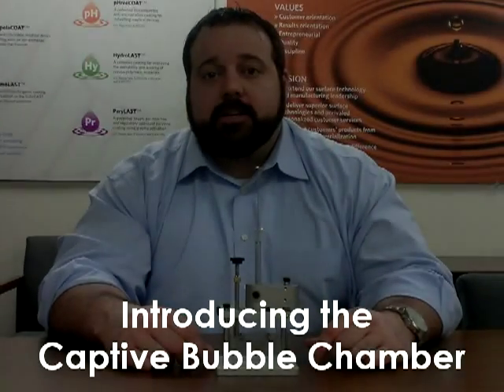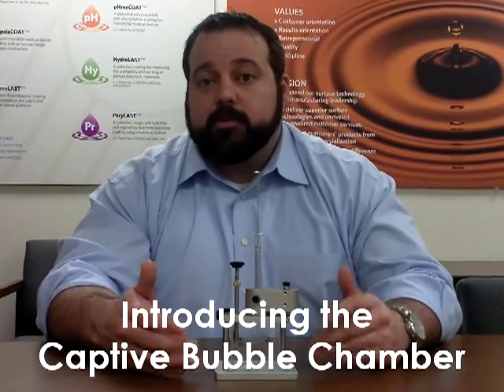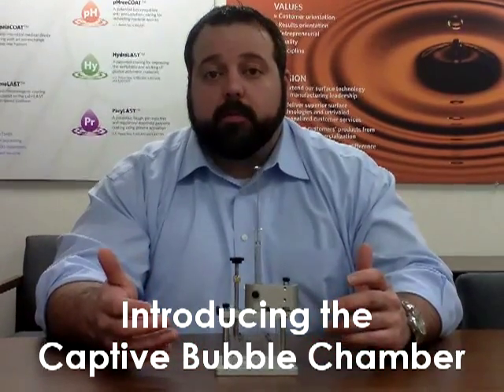Hi, this is Matt, and today I wanted to introduce our latest equipment accessory. This is the captive bubble chamber used to measure captive bubble with the VCA Optima. And now I'm going to demonstrate how to use it.